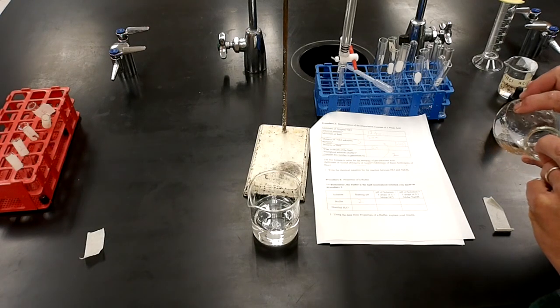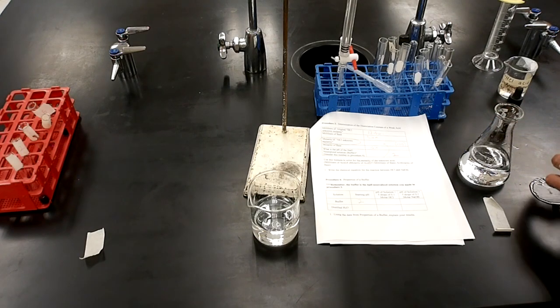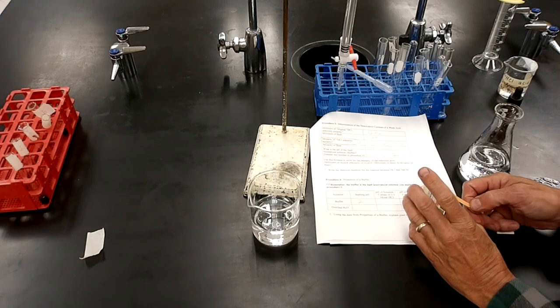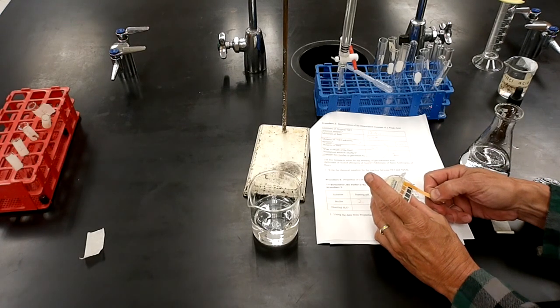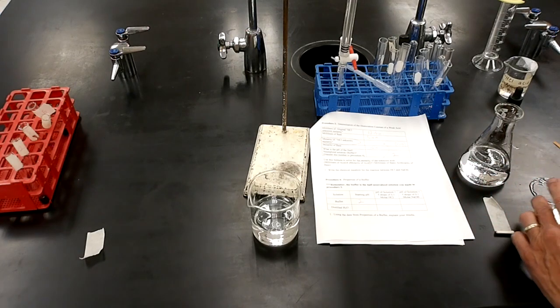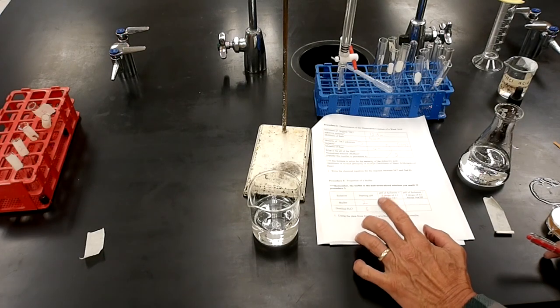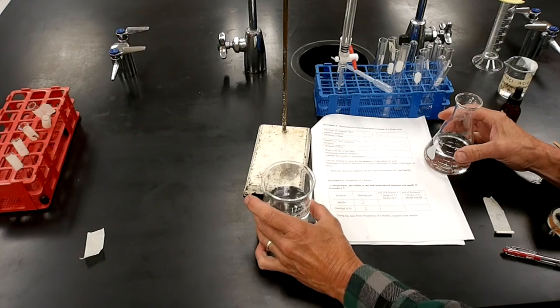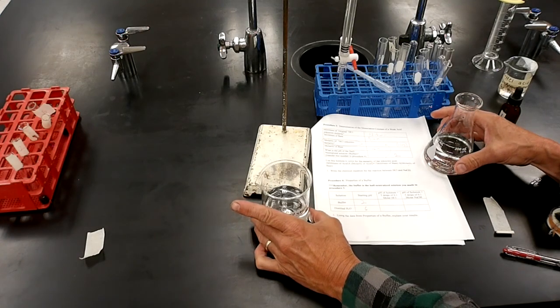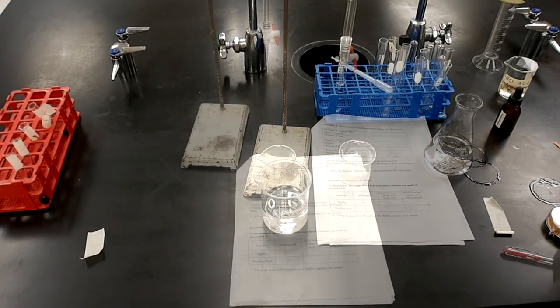The pH of the plain distilled water should be about 7. If our still's working right, I got about 6, so I'll write it down as a pH of 6. Now I have to run and get a couple small beakers, but what I'm going to do is take some distilled water and this buffer, and see how they respond when I add acids or bases, see how much the pH changes. Let me run and get a couple small beakers to put them into. Be right back.